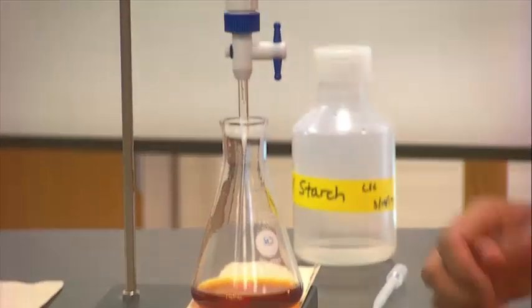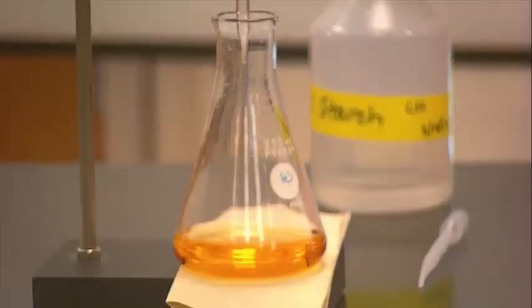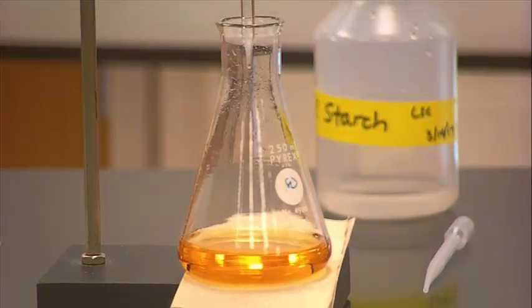I don't know if you can see this. Zoom in here, going towards the bottom. So as I am pushing this 2 mils below the equivalence point, I am stirring here. Remember, titrations can be very exact, but the dispensation of the burette is not exact. Okay, there. This is 2 mils prior to the equivalence point that I've calculated based on stoichiometry of the net reaction.